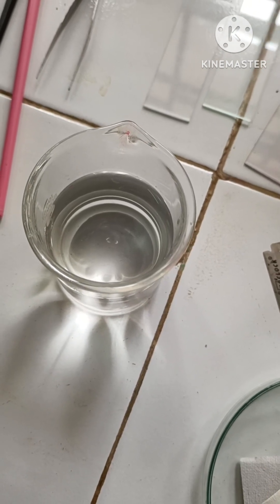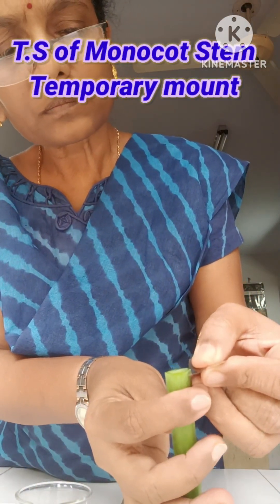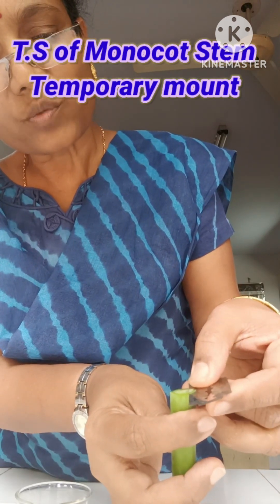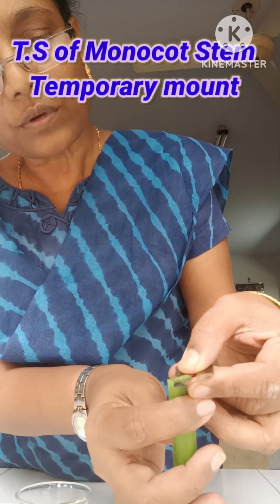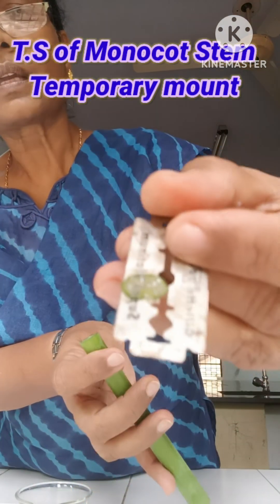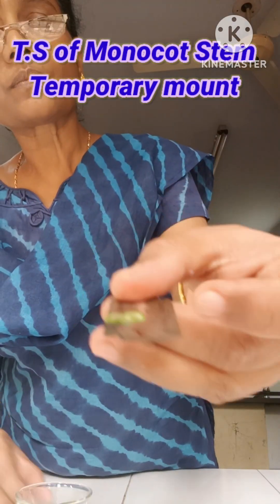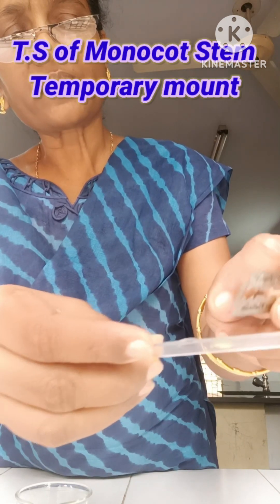So now let us start with the practicals. First, children, keep a drop of water upon the slide. Then later we can do the cutting. The thin slice now has to be taken — it has to be in a full circular form. Can you see, I have taken the cutting and it has to be placed upon the slide where you have kept the water.